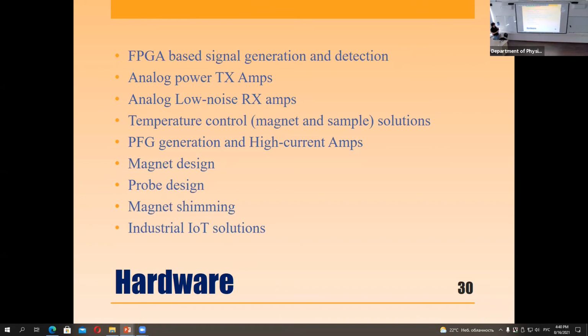This is something we can talk about a lot because I do this job myself. Then analog power amplifiers, strong ones that sometimes produce up to kilowatts if you want to deal with a big MRI, and up to, let's say, 100 watts if you want to deal with a small 5 mm test tube. Low noise amplifiers are another demand. To be competitive now, you need to have a good noise figure. You know what noise figure is? It is what your amplifier introduces into the signal. The noise figure must be below 1 dB. This is really low. It was not possible before, but now to be competitive, you need to produce such a device.